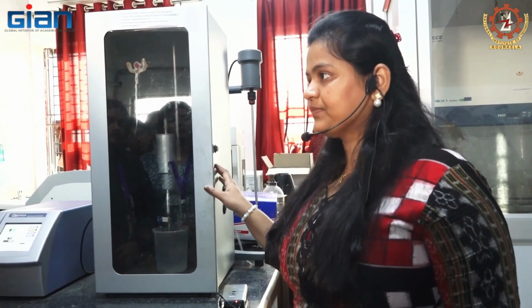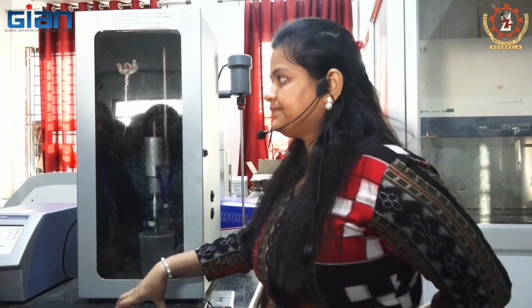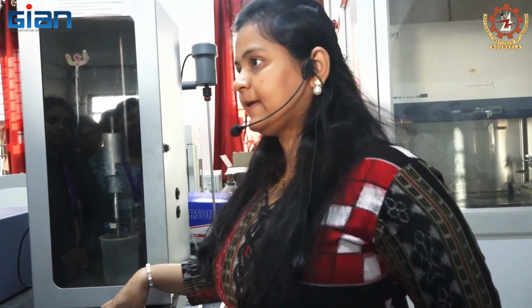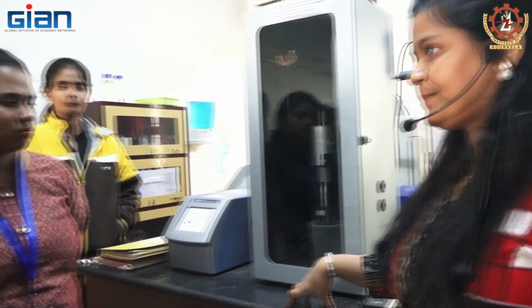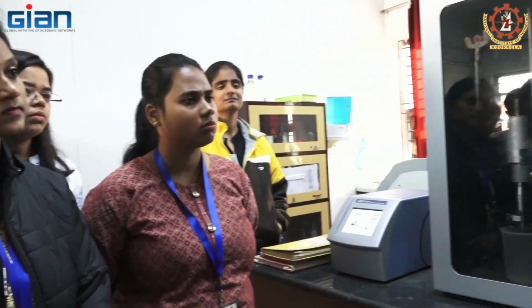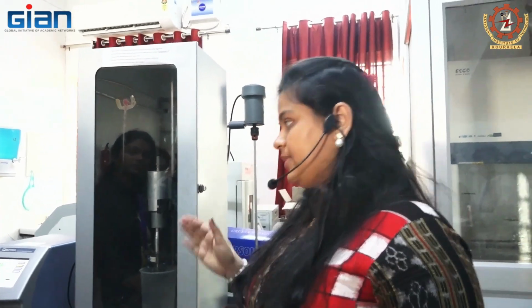Okay, the second one, what could it be? Any guesses, in ultrasound what is the second parameter? Yeah, while I am talking about essential oils, essential oil is very volatile in nature. This much vibration or this much mechanical disruption also degrades these samples.